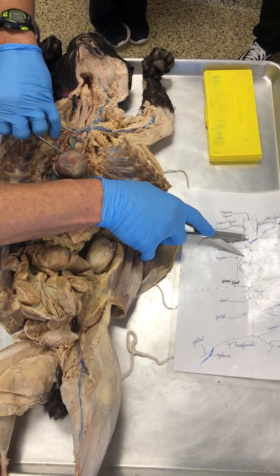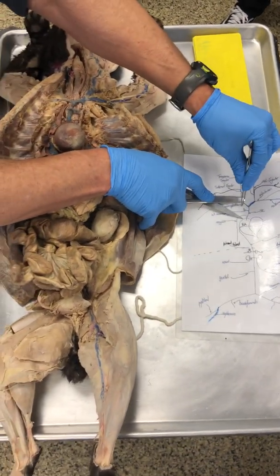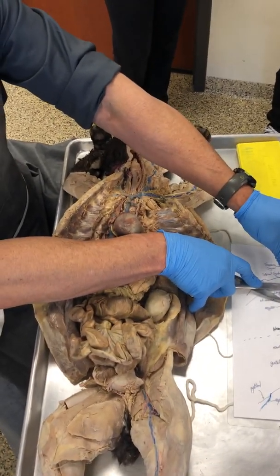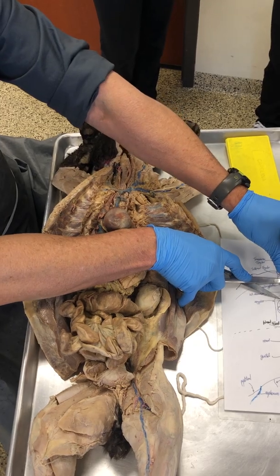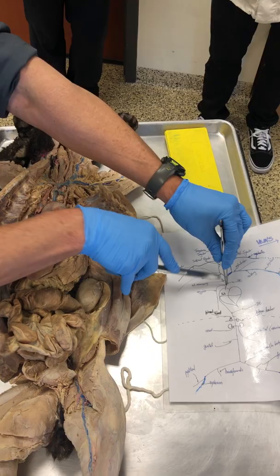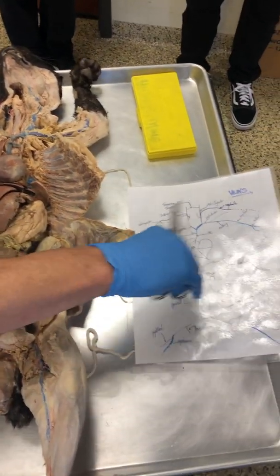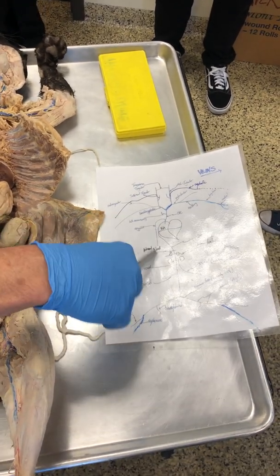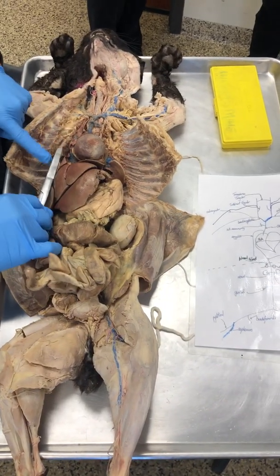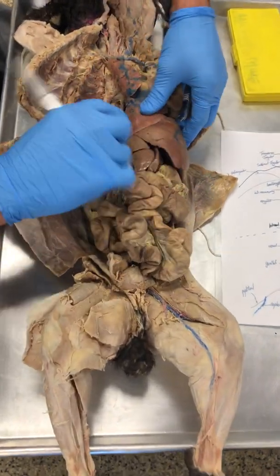Now, if you look at that, what do we see, folks? We see that there are one, two, three branches of the superior vena cava. Let's look at this first one. There's my superior vena cava into the right atrium, and here's the first one that drains into the superior vena cava. Again, look at relationships. There is the right side, there's the left side, and notice where this vein is located: on the right side of the heart. I can't see it here yet, because what do we need to do? We need to tilt all of this over.